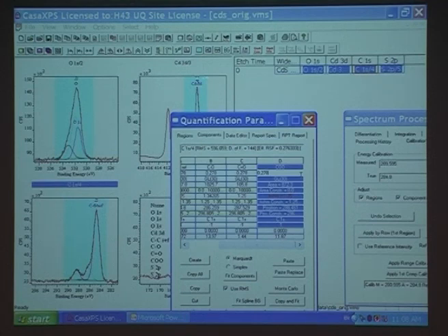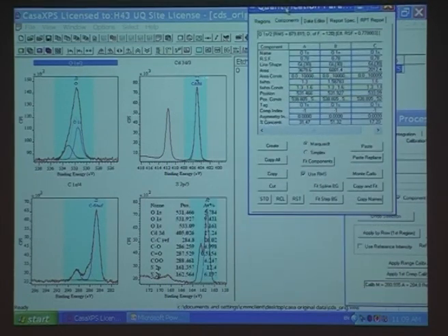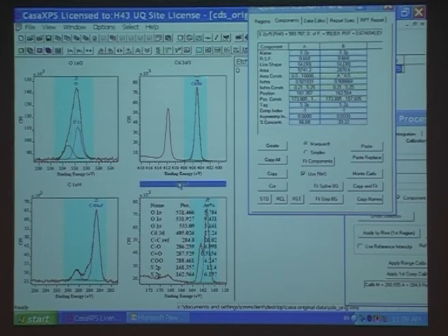The reason I've labelled those is I want to try and account for all this oxygen, because I want to work out just what the chemical composition of this crystal surface is. So now I've labelled them, I go into the oxygens. Before we go any further, I'm going to come into the sulfur.